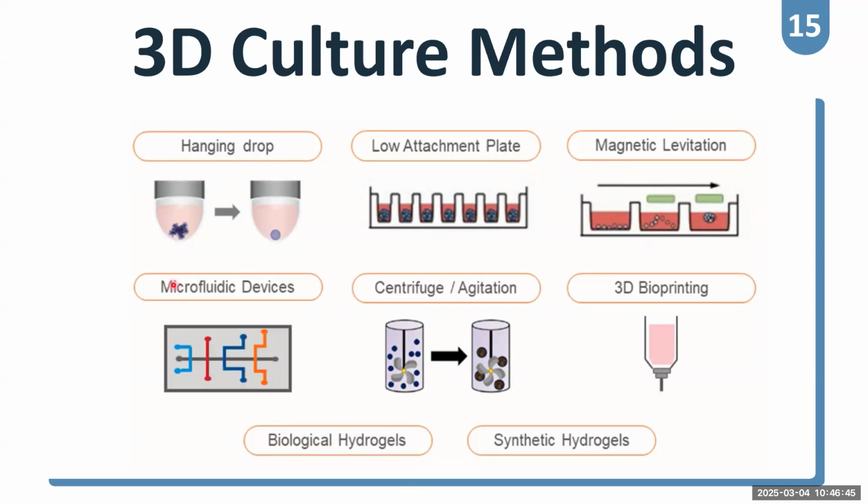Okay, and now the microfluidic is quite beneficial because, as you see, they have lines to put the cells, three or four or five, depending on how much money you can spend. You see the central line here; each line holds a different cell type.